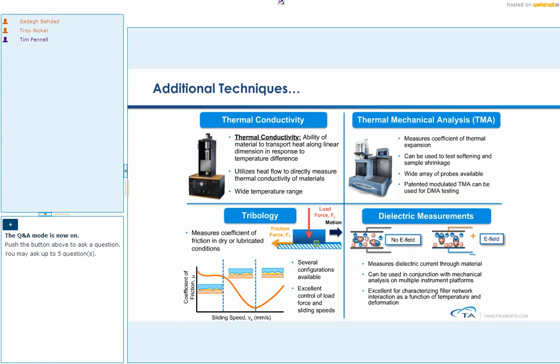This is a more sensitive technique than DMA, so it's perfect for studying the effect of fillers that you have added to your material and how the filler network interacts and changes as you're applying mechanical deformation to it.